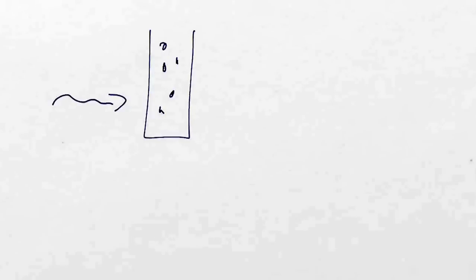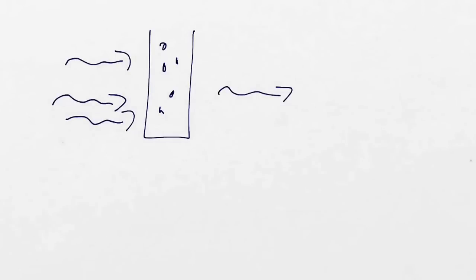It has to be the right wavelength, because otherwise these molecules won't interact with it. And we measure what's coming out at the other end. And from this absorbance here, we can calculate the concentration if we know the extinction factor.